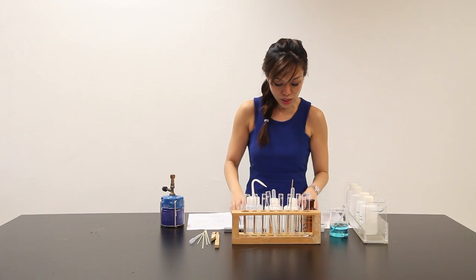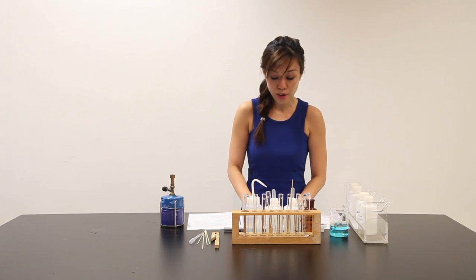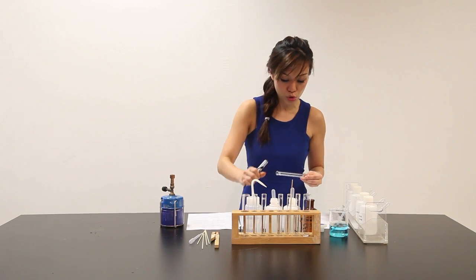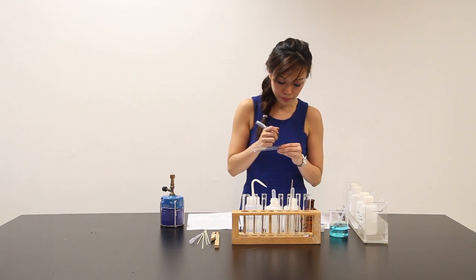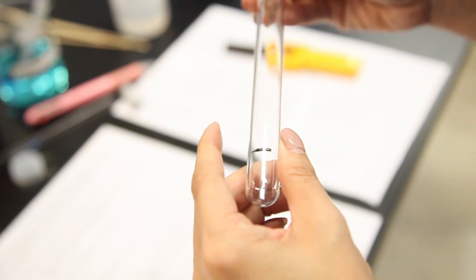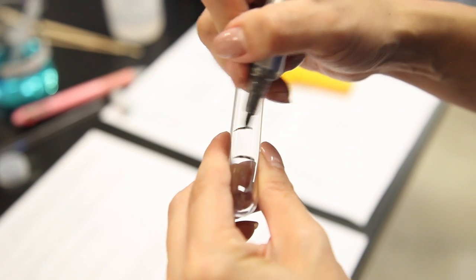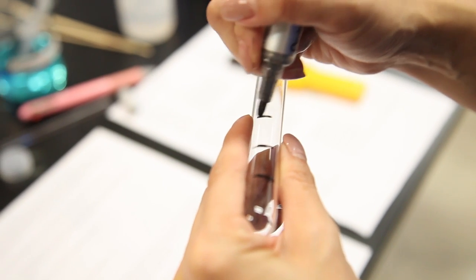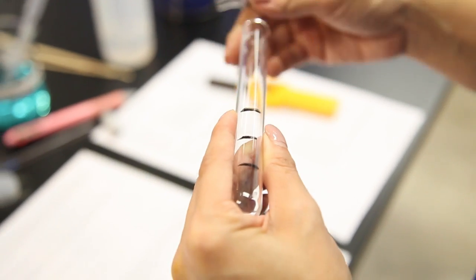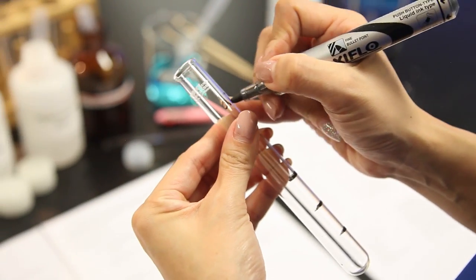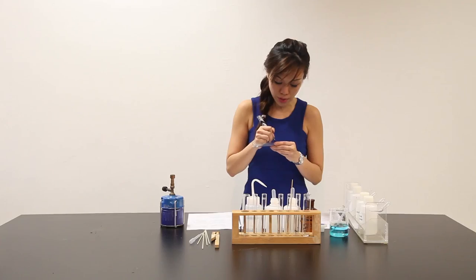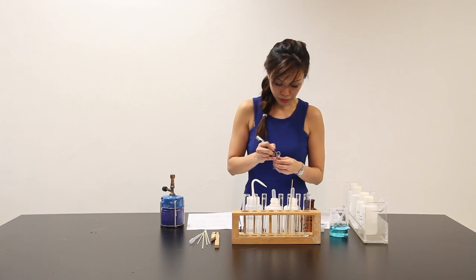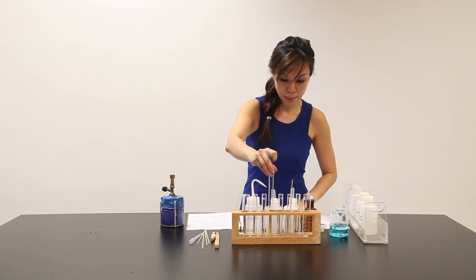And then it moves on to say, using solution Y, perform the following test and record your observation to about 2 cm³ of Y. So I'm supposed to draw out 2 cm³ of Y. And add another 2 cm³ of barium chloride.